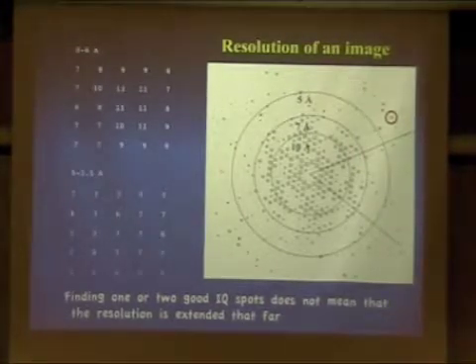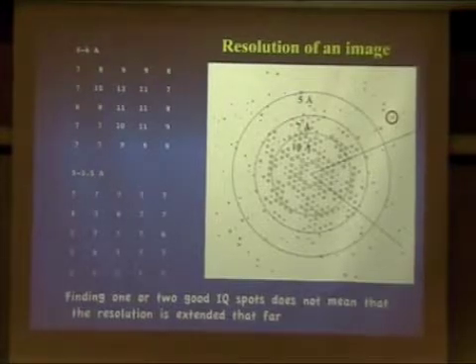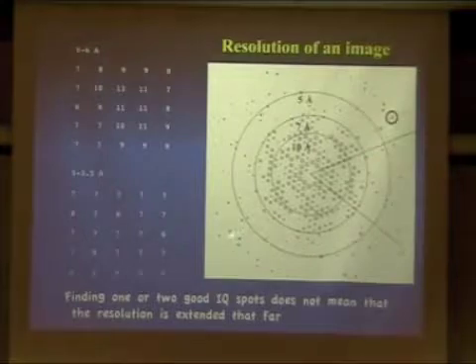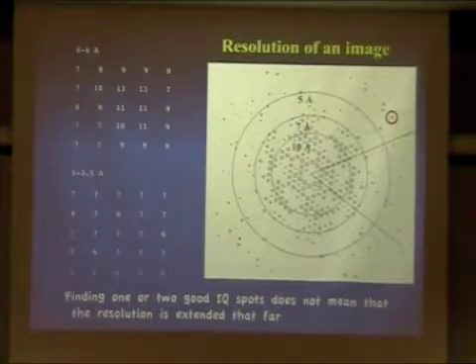Anchi, what happens if you have the same one on the other side, if we pair them, can this be used as a judgment to say that one is actually a good spot? No, you cannot, because in the computed Fourier transform, this is generated directly, so they are always equal. So if I have a spot here, I have to have a spot here. This is really only generated, in a sense, on half of it. Just to follow up there, actually only the right half of the Fourier transform is even saved in memory, and the left half on the screen is just generated from the right half.